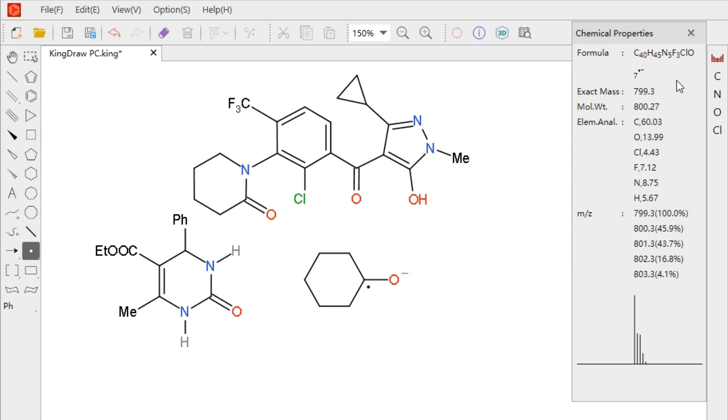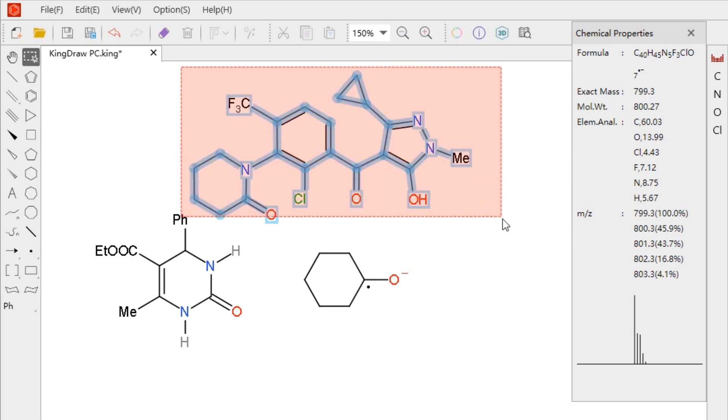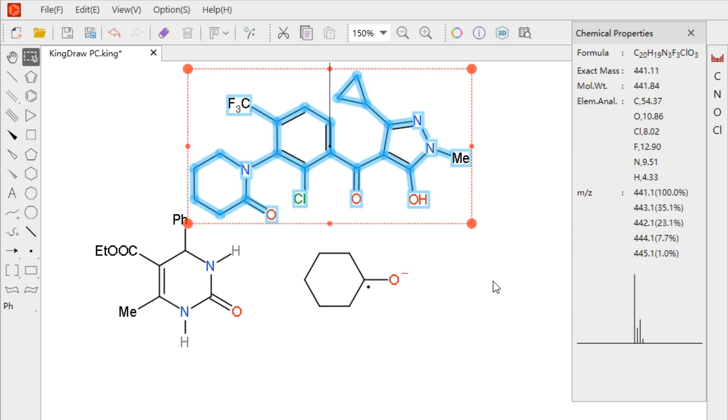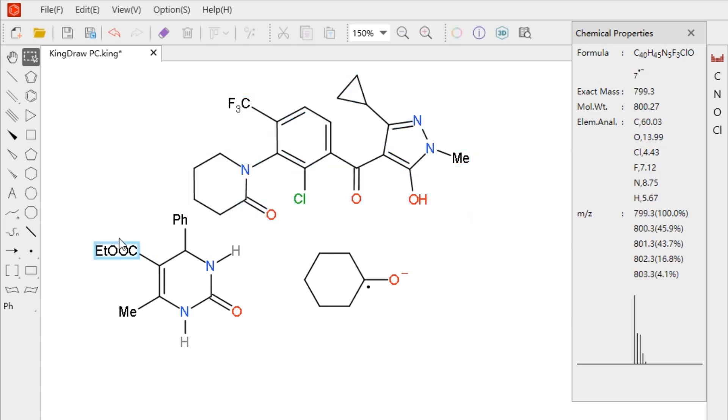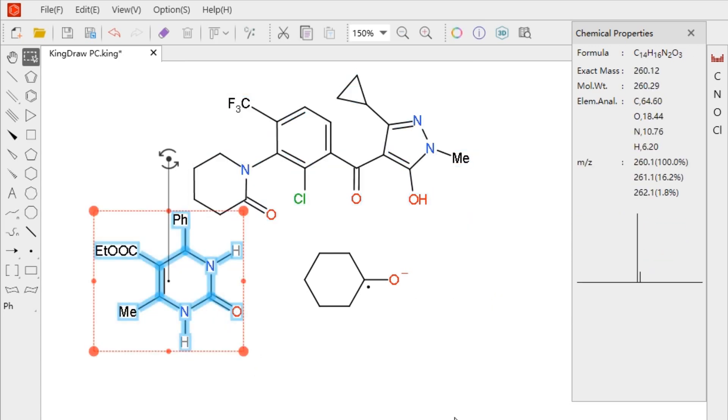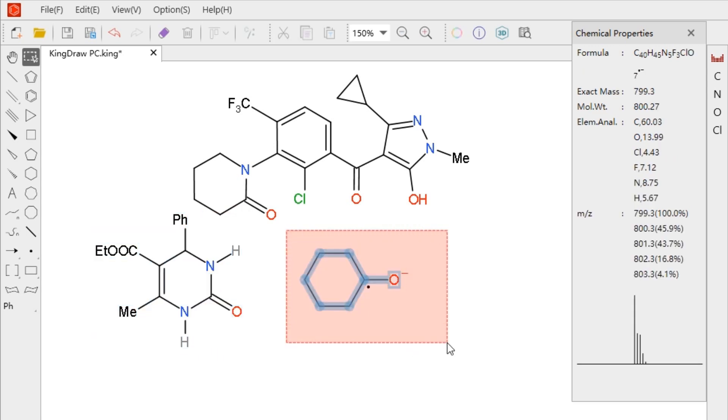If we need to view the properties of a single structure or part of it, we only need to use the marquee tool. The data in the chemical properties window will be calculated in real-time according to what we select.